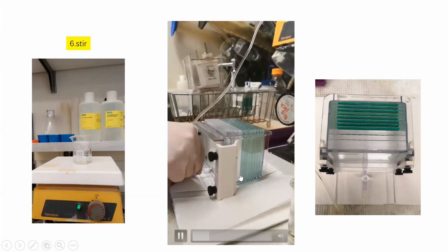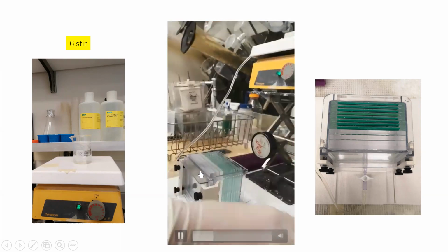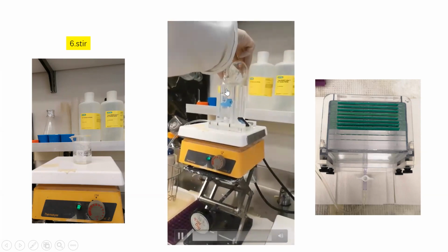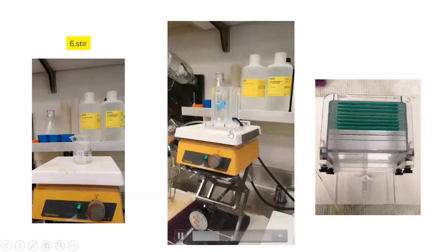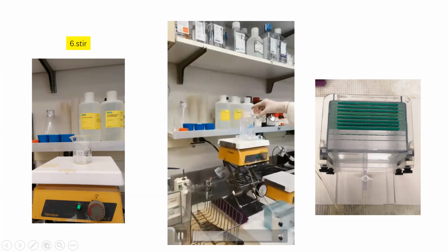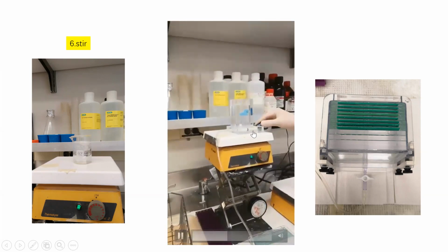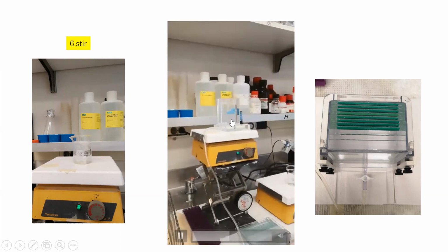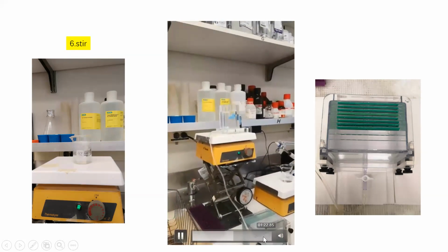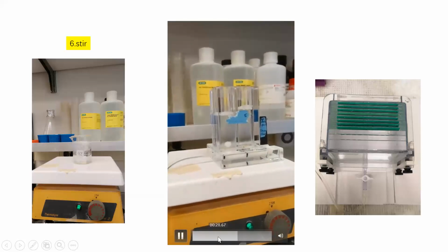And after the buffer level is up to 1 millimeter, we close the switch and add the rest of the 4% buffer here. And again, we add the 20% buffer in another part. And at this time, we will open the switch and make sure the 4% and 20% mix together, and wait for the buffer to mix and go down to the chamber.